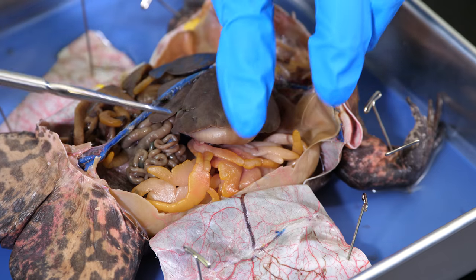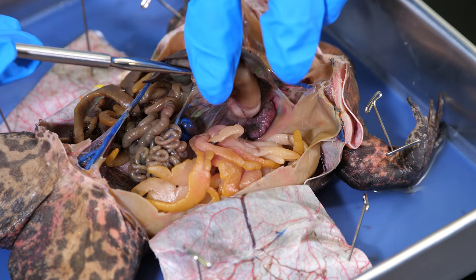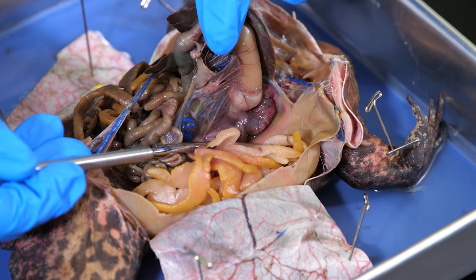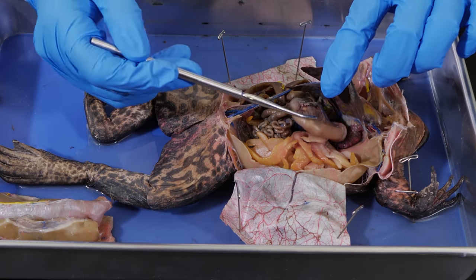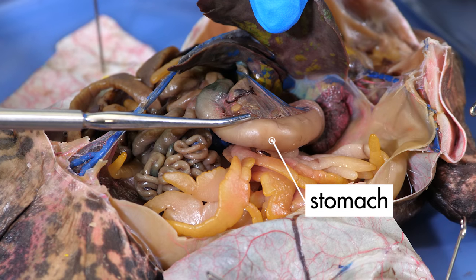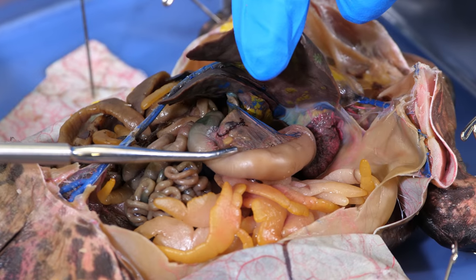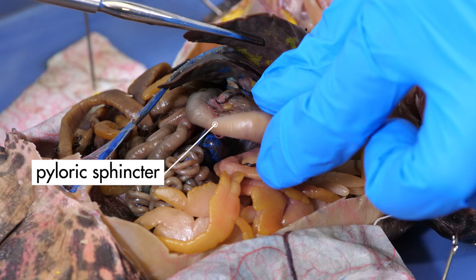The esophagus connects to the stomach, which is partially hidden by the liver. If we pull up the left lobes of the liver and move the stomach, we can see where the esophagus connects to the stomach. From the esophagus, food passes into the stomach, where the food is mixed with digestive enzymes to continue chemical digestion. We can clearly see some of the mesentery that holds the stomach in place. At the base of the stomach, we can feel a hard knot. This is the pyloric sphincter, which is a muscular valve that closes off the end of the stomach.